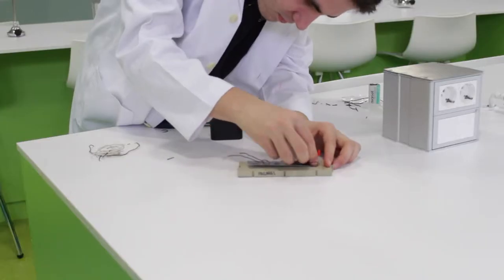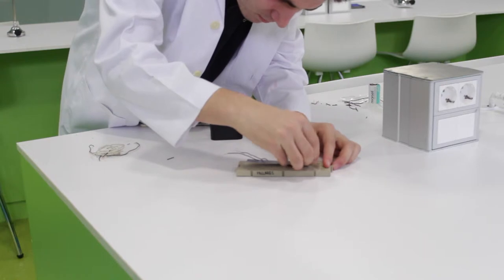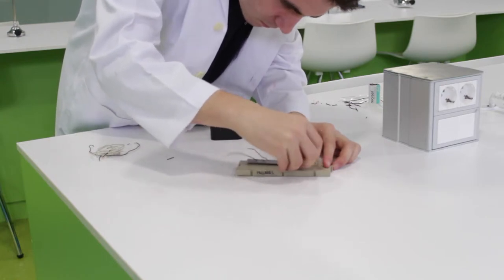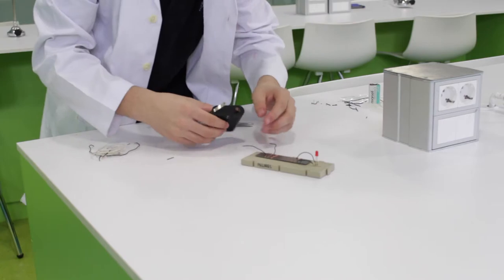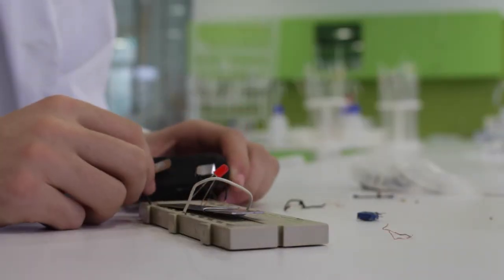Now let's start testing. We are building a simple electric circuit in order to test conductivity. If the light bulb turns on, the material introduced in the circuit is an electric conductor.